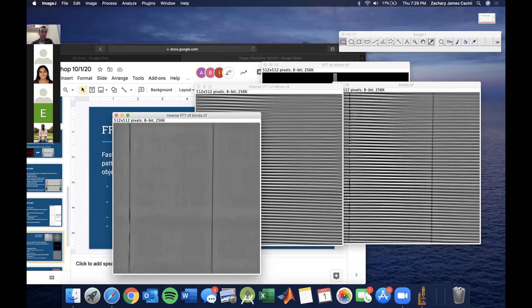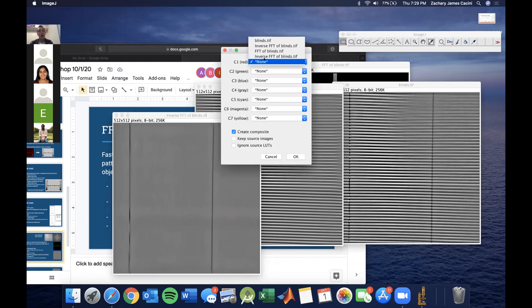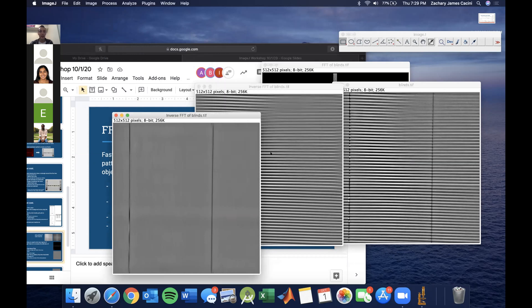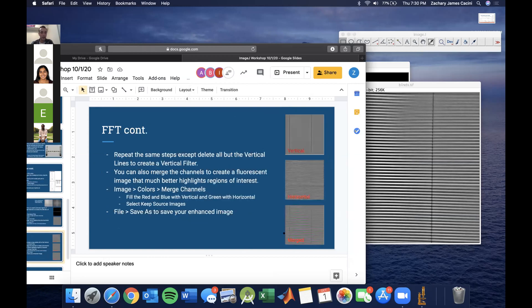Another important thing you'll be doing is merging the channels of these pictures, which Iksha already talked about. The same process: merge channels, choose your files — maybe name them a little better so you know which is which — and then you'll get a picture like this. We took our vertical and horizontal patterns and made it so that all the horizontal components are purple and all the vertical ones are green.